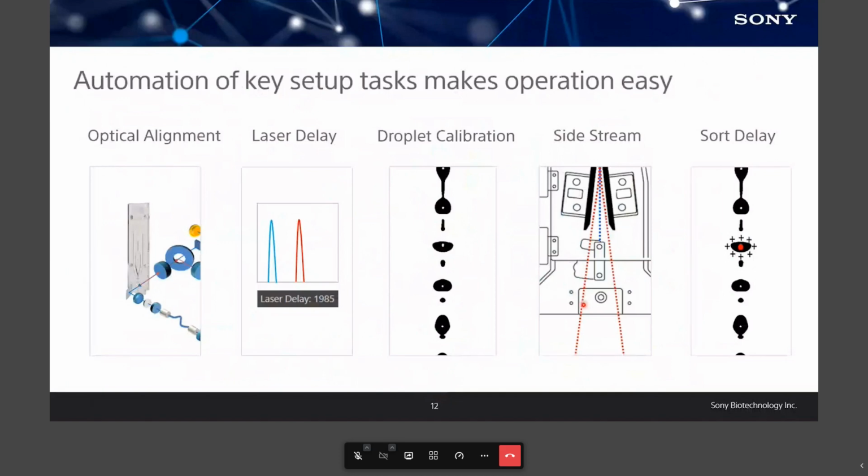So whether it's tubes or plates, whatever it happens to be, we want to calibrate the angle of those side streams effectively so that they're not just spraying all over the inside of the machine, or worse, going into some place you don't want them to, and now you don't have the purity that you thought you did. And finally, we need to make sure that we're charging the droplets we think we're charging, right?